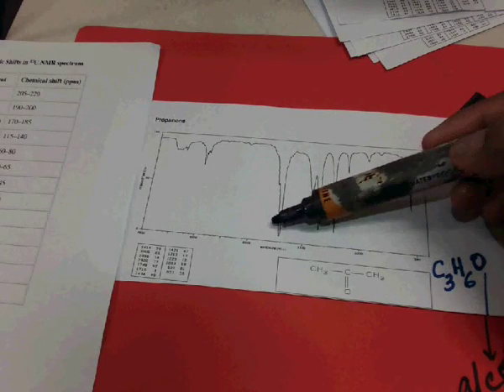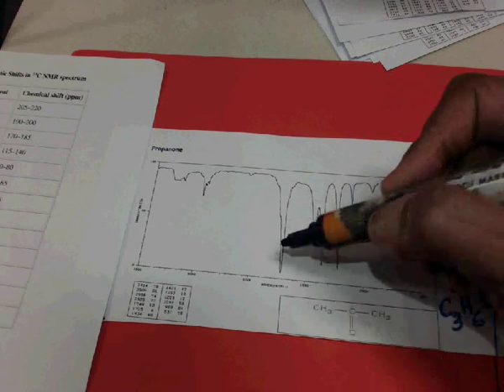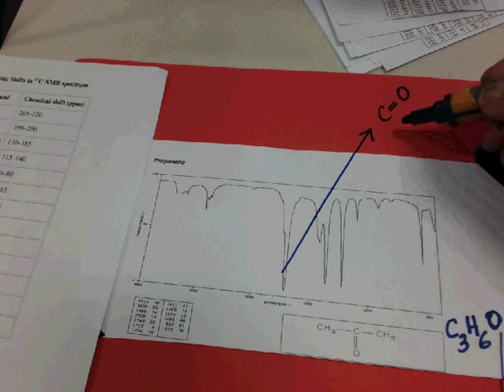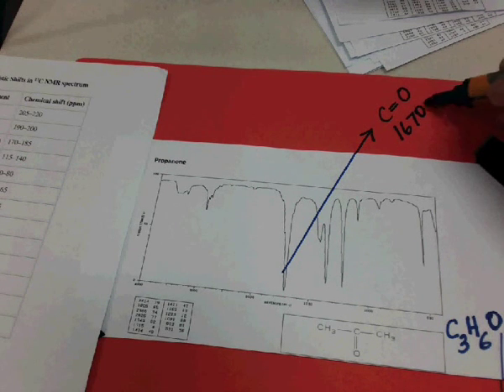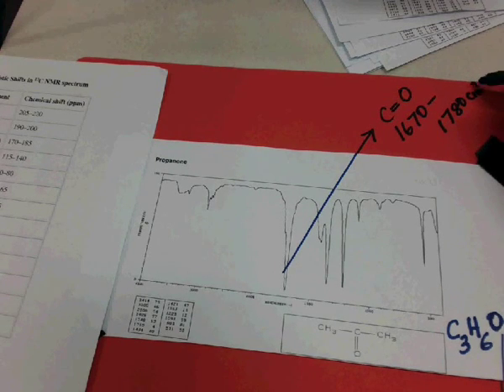Yes, we do. You can glue this into your books and draw an arrow and say that that is the C double bond O, which is between 1670 to 1780, and don't forget the unit.